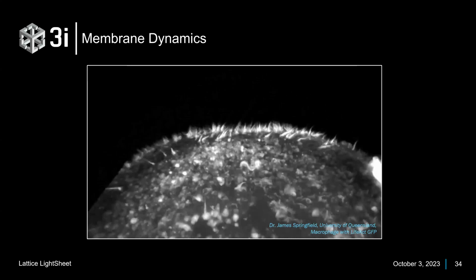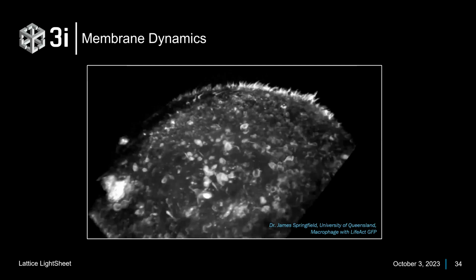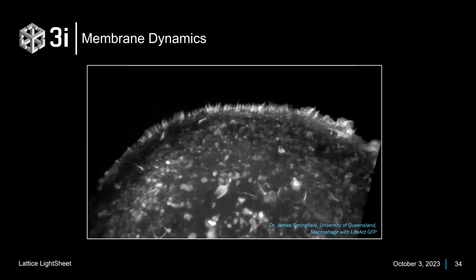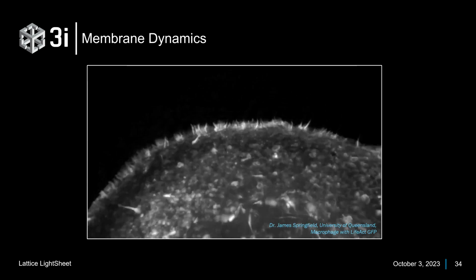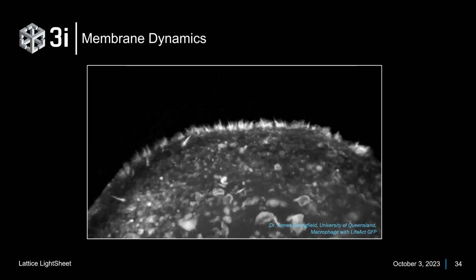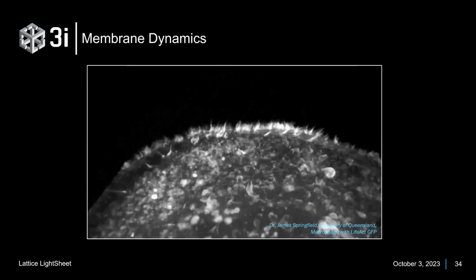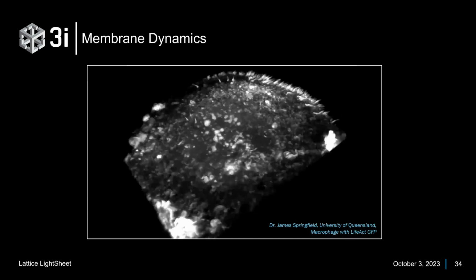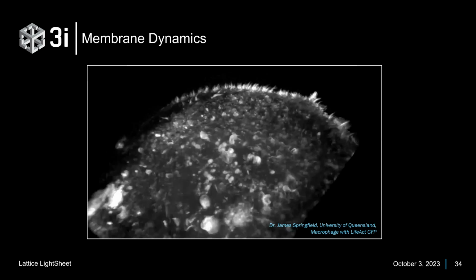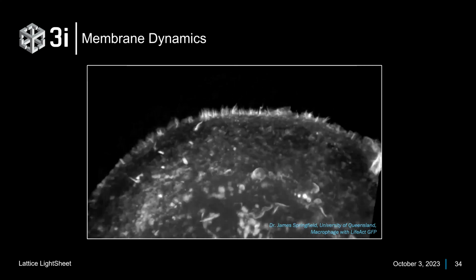This group was studying a new form of cell internalization, a form of macropinocytosis, which they deemed tent pole formation. There's a wonderful paper on our website about it, where if you watch closely, you'll eventually see two little things stick up. It forms a little cup, and then it drinks it in. They knew of this from static imaging, but had never been able to watch it in real time because nothing they had was either fast enough or gentle enough to do this. And it doesn't happen on the bottom of the sample, so they couldn't do this with TIRF. So really cool, lovely dynamic imaging.